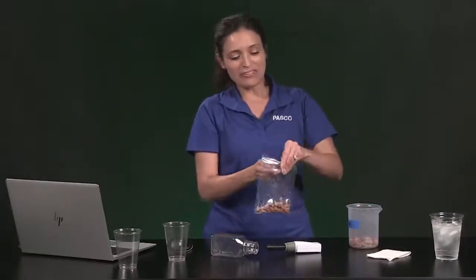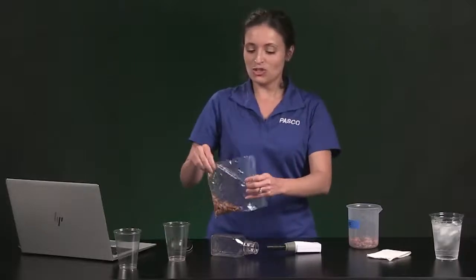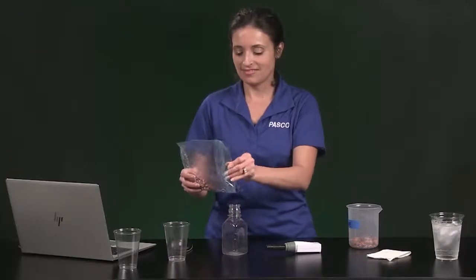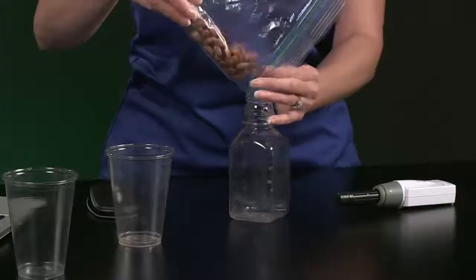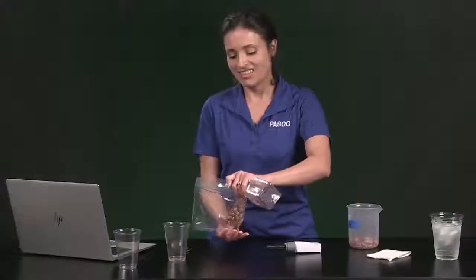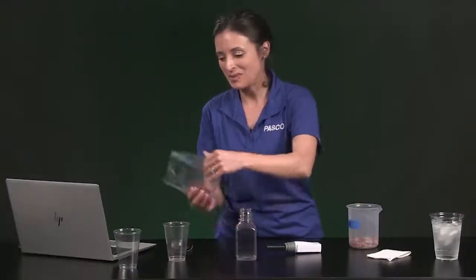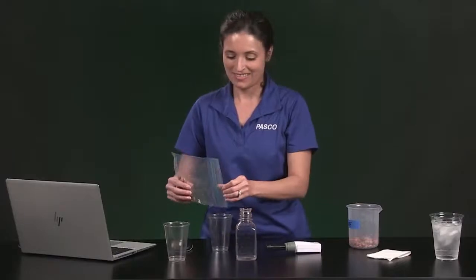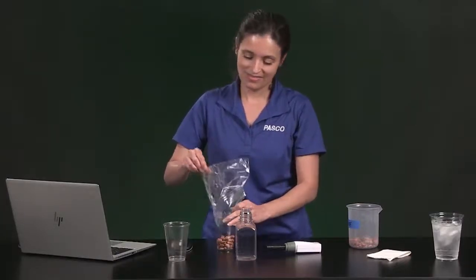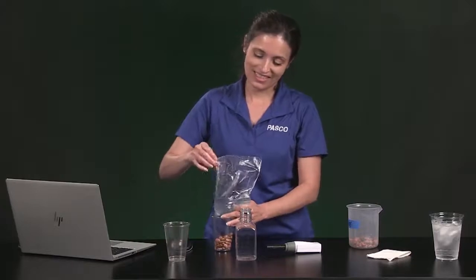Now I'm going to add about 25 milliliters of chilled germinating seeds to the bottle. To make this easier, I think I'll pour these in a cup first and then pour them in the bottle. Get in there.